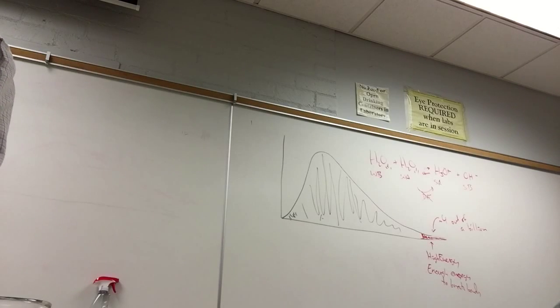Let's try the distilled water. And the electrodes are in the distilled water, but do you see any light? No. There's no light. Telling me that distilled water does not conduct electricity to any significant extent. In fact, for the electrochemists who are interested in conductivity, they just want to know how well it conducts electricity. Distilled water is classified as an insulator.